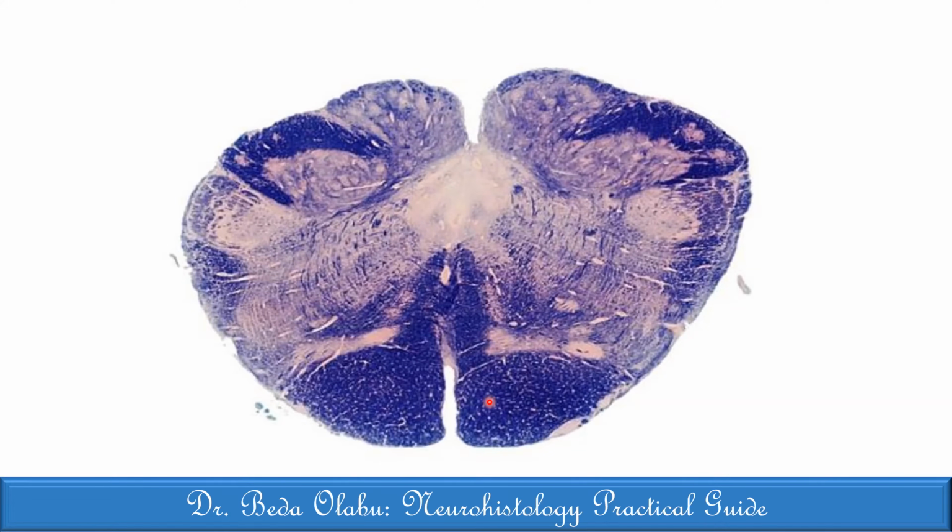Then I'm not sure about just posterior to the pyramids and anterior to that ventricle, we can see another bluish black substance. I don't know if that is the medial... So me, I'll take this section. The only thing I can see is the distinct pyramids, meaning this is at the level of the sensory decussation, because the pyramids are distinct, they are wide apart.